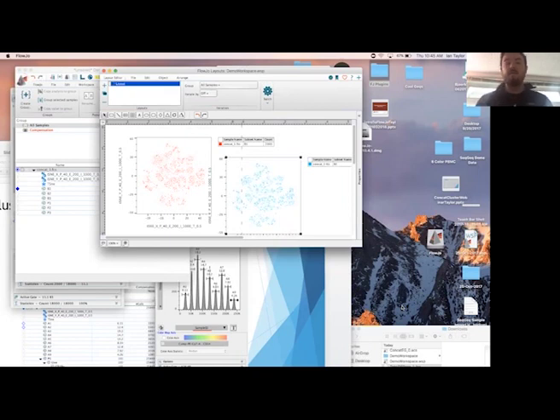Proliferation tool would help. Yeah, oh, I know what you mean. So what this user is suggesting is you could utilize the auto gating from proliferation in order to potentially separate out the different samples. That's an interesting question. I don't know if I want to try it in a demo here, but that actually might work.